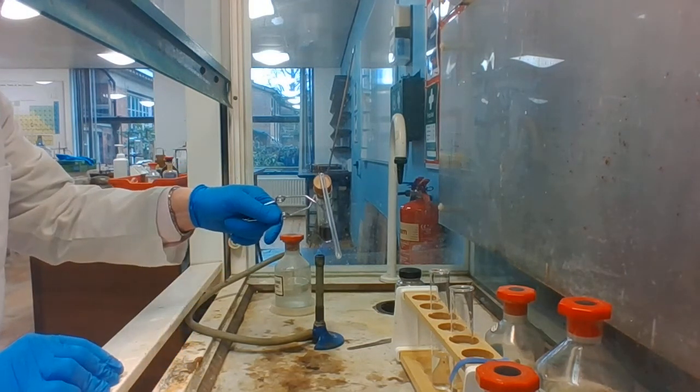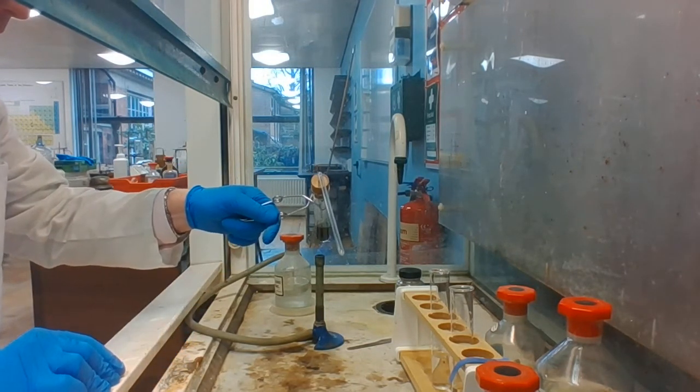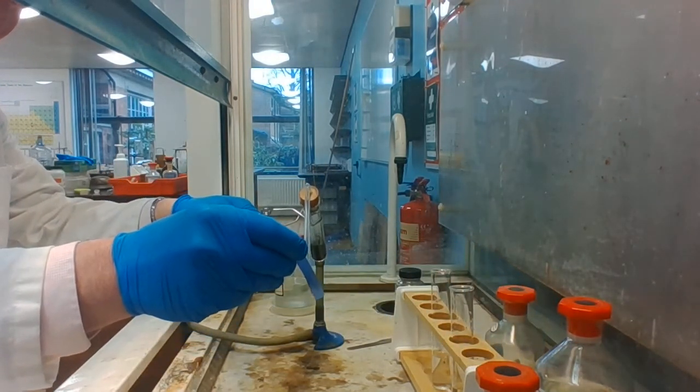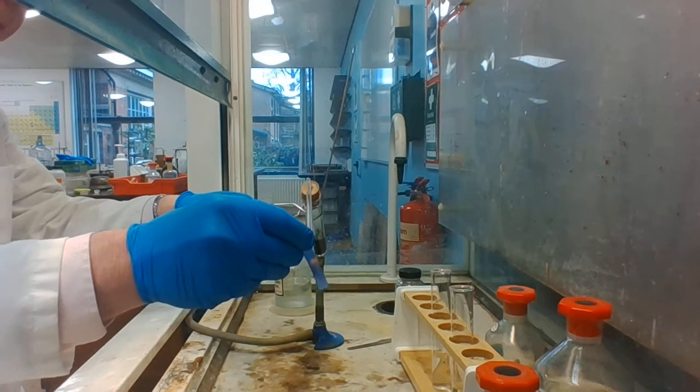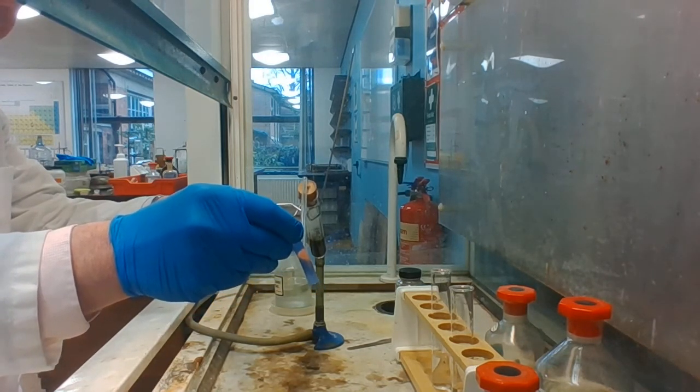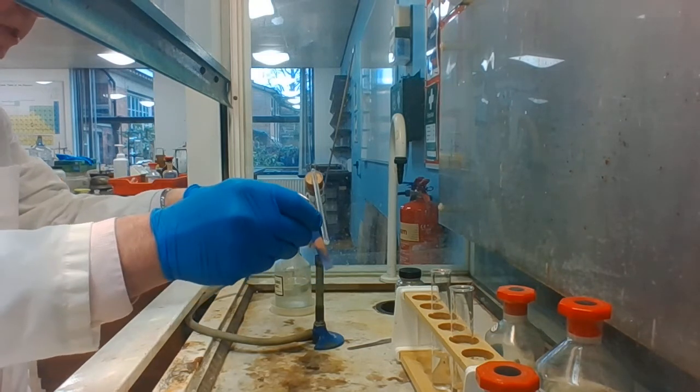And we can test to see if chlorine gas is being produced by seeing if it bleaches some damp litmus paper. I'm going to see it's already going red, so I think there's some chlorine gas coming through.